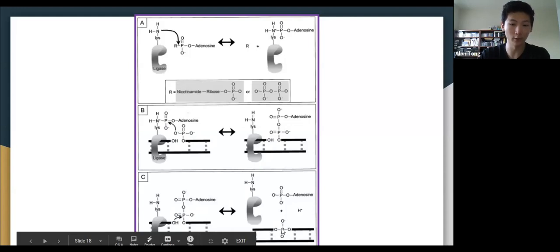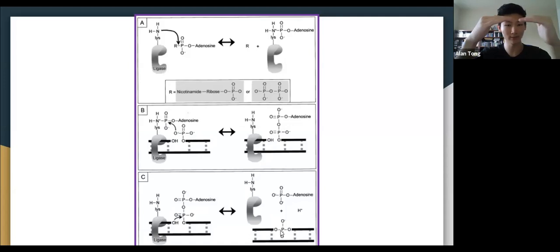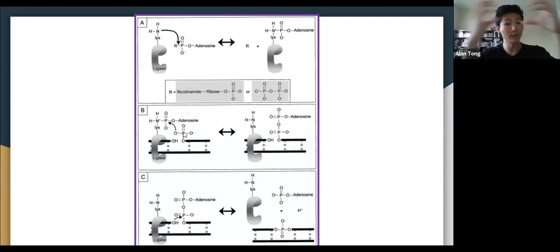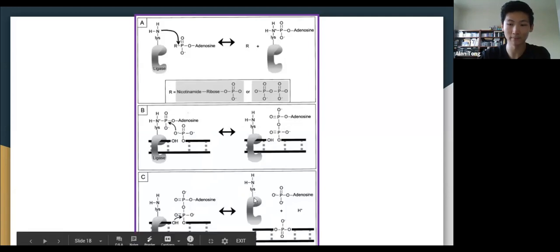So then you form your phosphodiester bond between those two strands. So this is your ligation event. Your ligase has to find where there's that break, and it also has to detect where the phosphate group is, and bring them together to form that ligation event. Enzymology, there's a whole lot more you can go into, but this is a scheme that shows how it works overall.